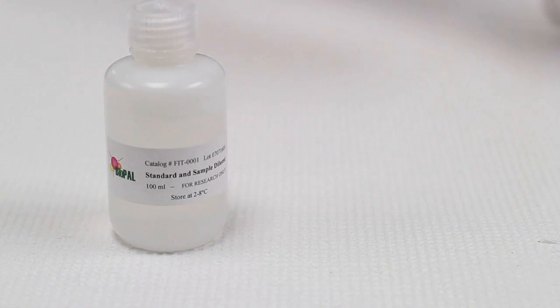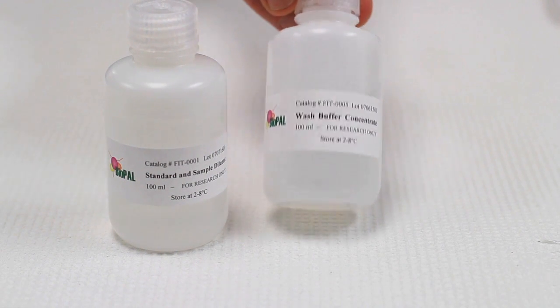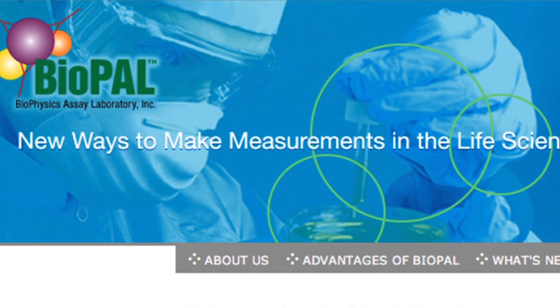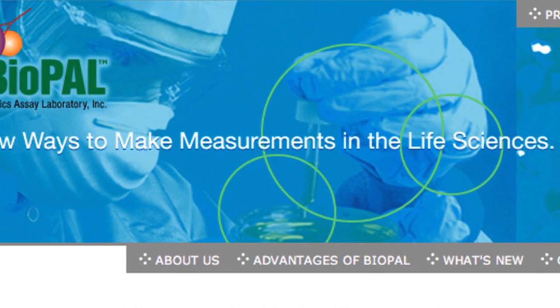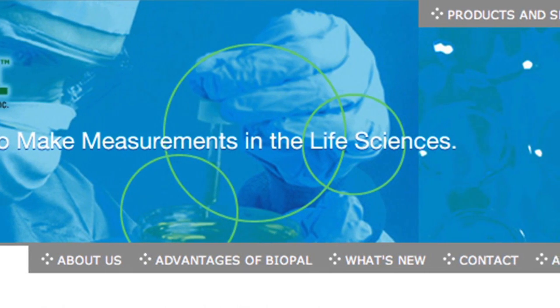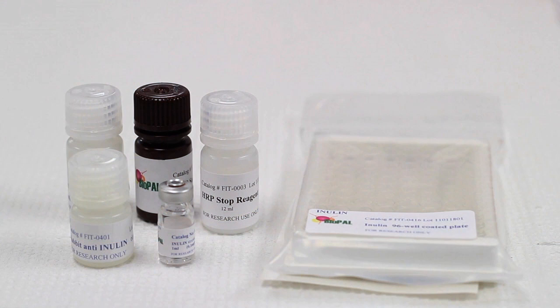Two additional reagents that are needed, but not provided in the kit, are standard and sample diluent and wash buffer. However, the recipe to make these two reagents is provided within the kit manual, which will allow you to prepare them in-house. These can also be ordered separately as ready-to-use reagents from Biopal. All components should be refrigerated until you run the assay, whereby all reagents should then be brought to room temperature before use.